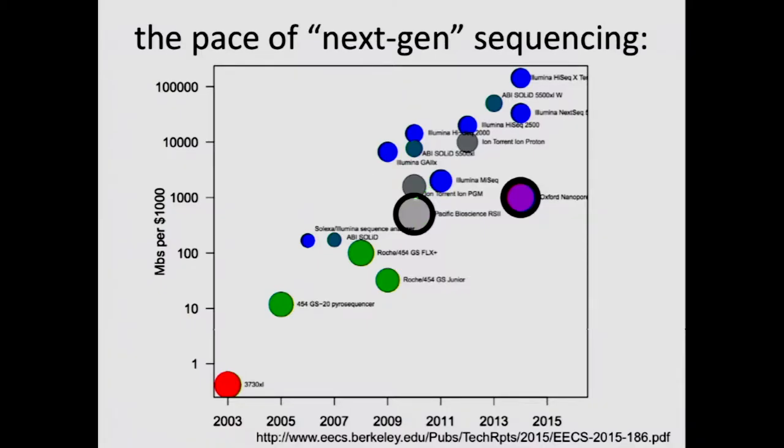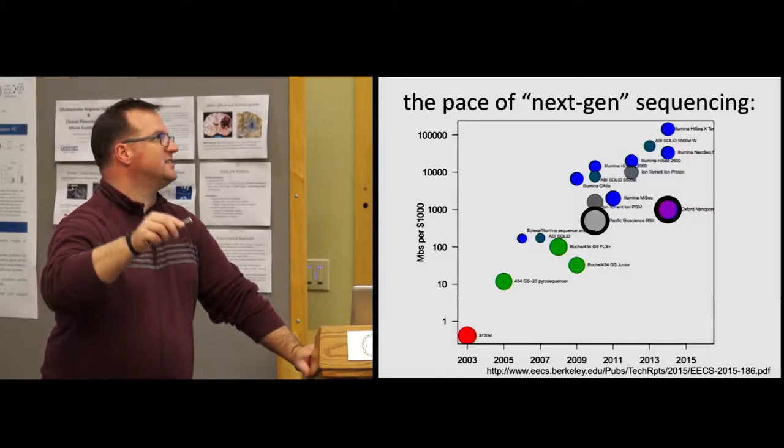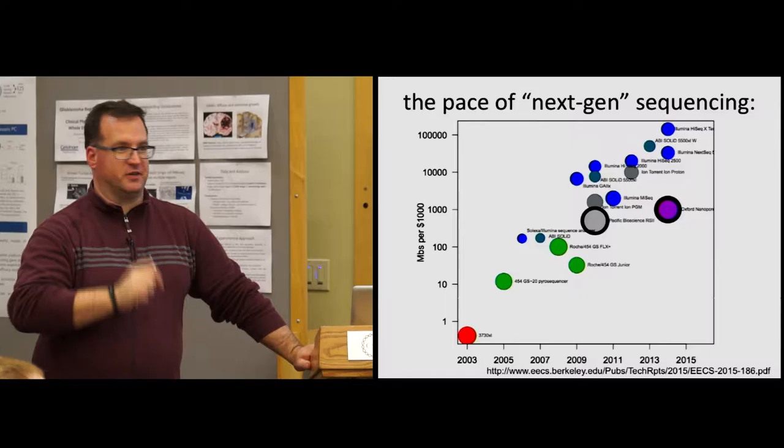And then the other thing he's done, which is kind of cute, is just as a visualization technique, the width of the outline of each circle is proportional to the error rate. So the error rate on PacBio and Oxford Nanopore is much larger than the error rates on these other guys. And so we'll look at that in a minute. And so it'll be interesting to see as things evolve. There's a lot of work going on at PacBio right now for a new PacBio sequencer, whether it's going to move up here or whether it's just going to move over here but have a much thinner outline.